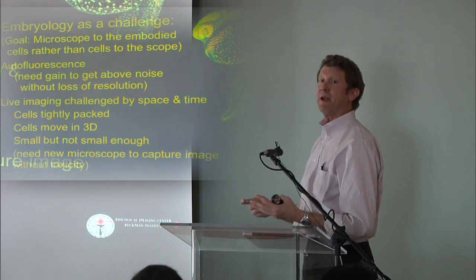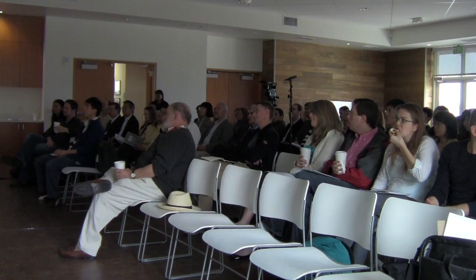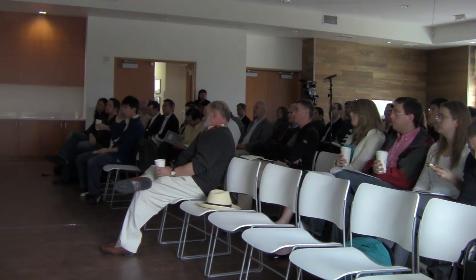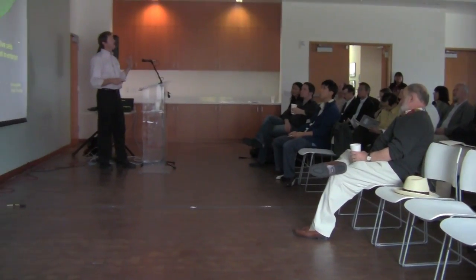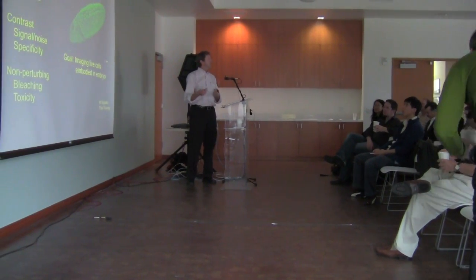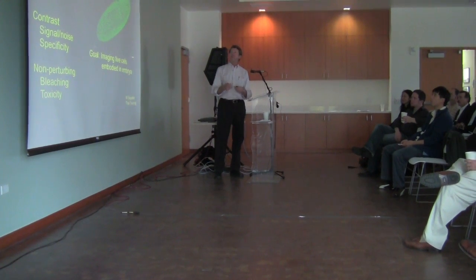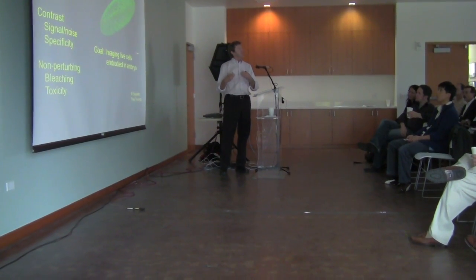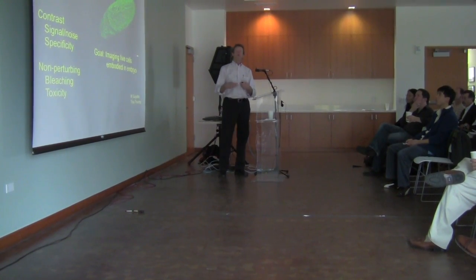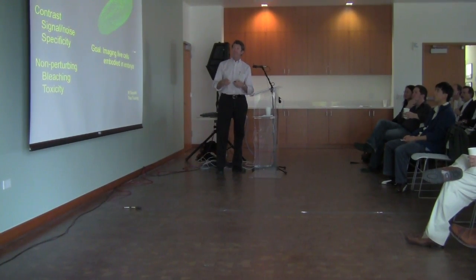None of these were built with an evolutionary constraint for imaging being important for their survival. And the cells are packed and moved and everything else. So I just want to show you one of the ways that we've been trying to get around some of these problems. And that is to try to make machines that let us follow a whole tissue. In this case, it's a Drosophila embryo. We use those because they're more sensitive than human or other vertebrate cells to light. So if we can develop a technique that lets us watch each one of the cells in this embryo as it develops, we have a chance of applying that to intact tissues in a vertebrate system.